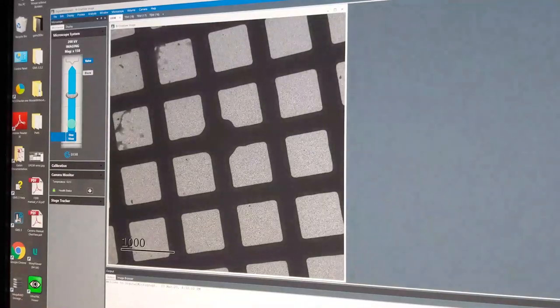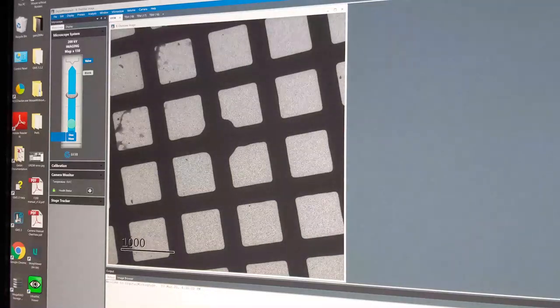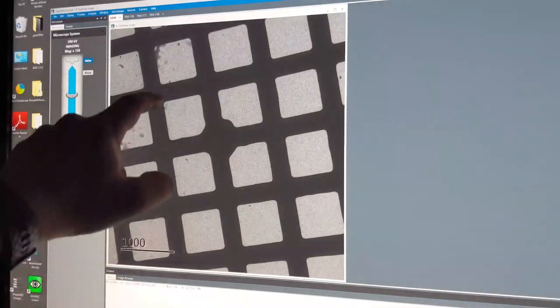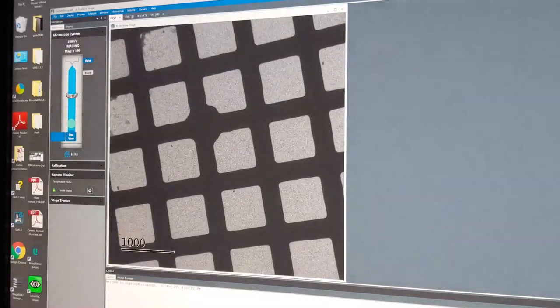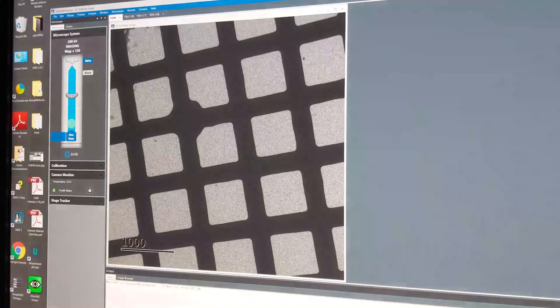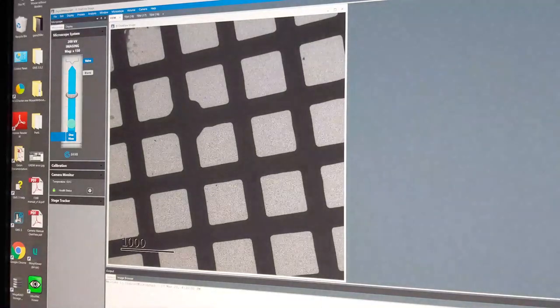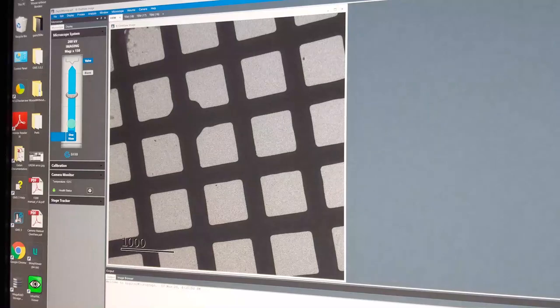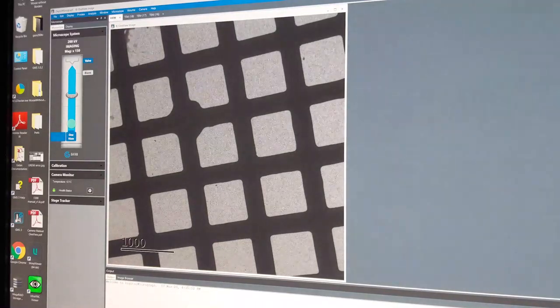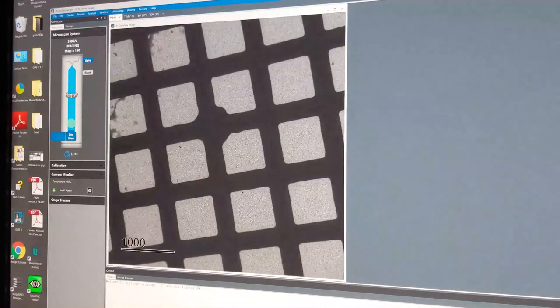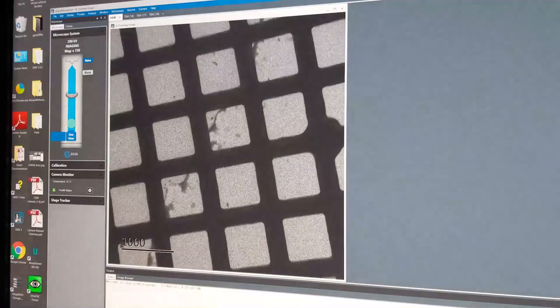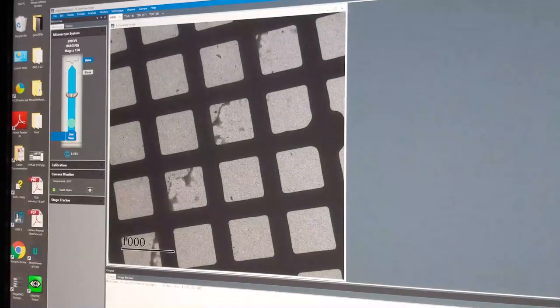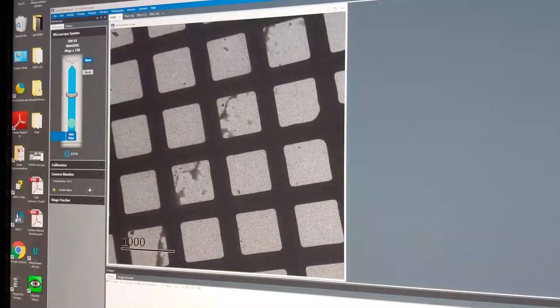Here the copper is far too thick, so any electrons that hit it get absorbed and we don't get any contrast or intensity from those regions. But what we do see is bright regions in between those bars — those are the holes which have the carbon support film over the top. Because the carbon film is very thin, about 10 nanometers, and made of carbon which is a very light element, the electron beam doesn't get scattered very much by it and passes straight through. We can see that over here there are some areas where material is sat on top of the carbon film — those regions contain the sample.